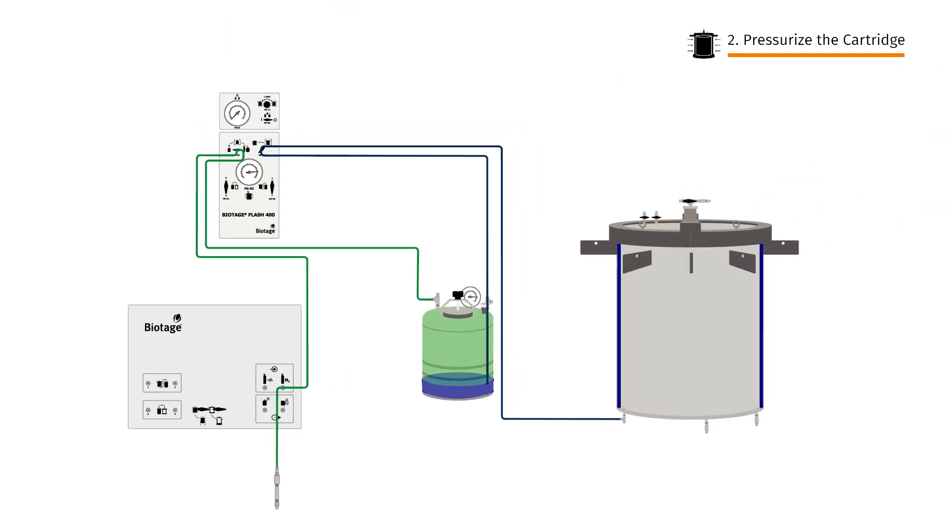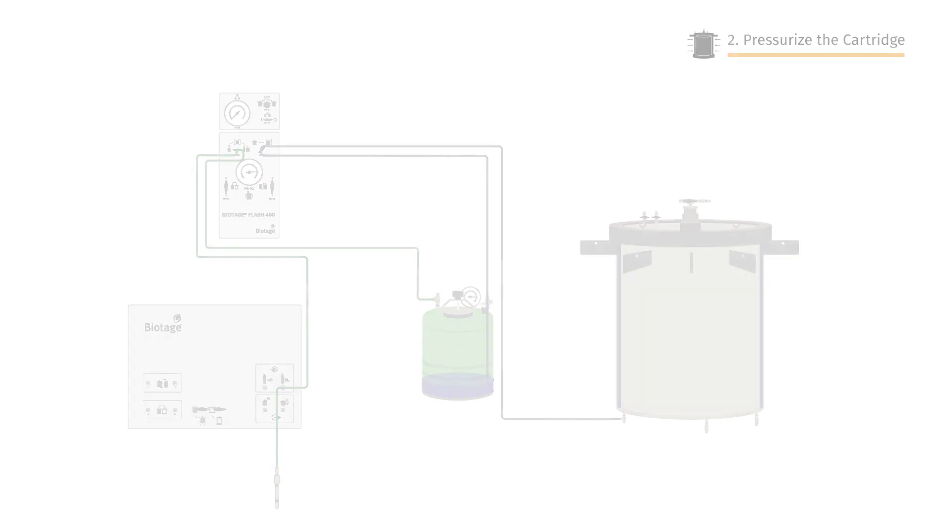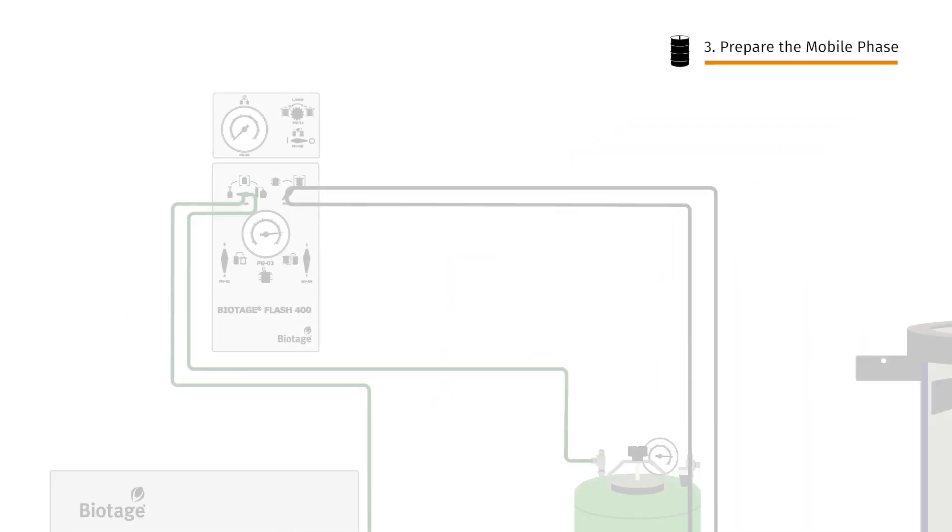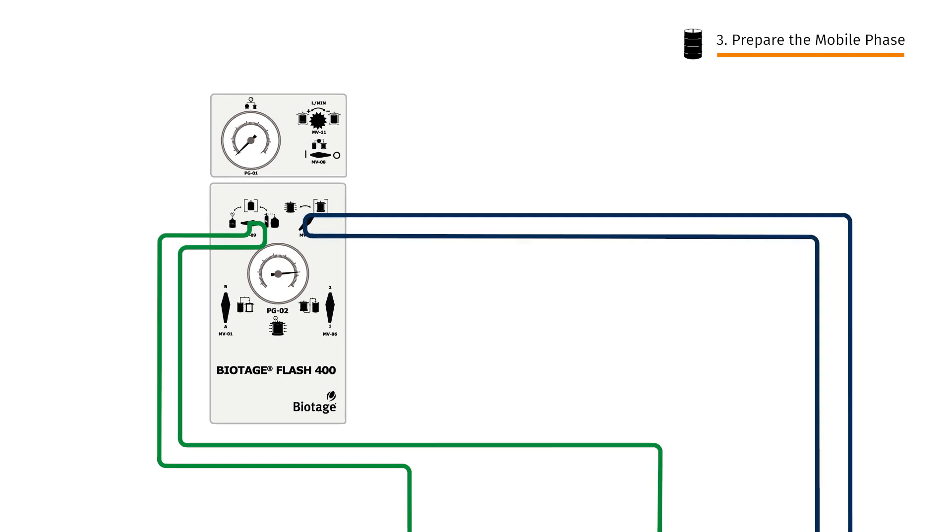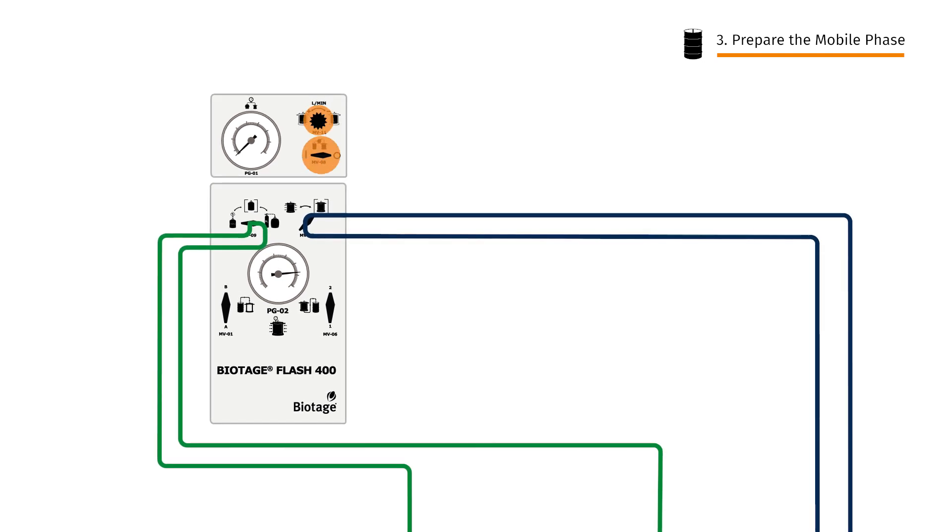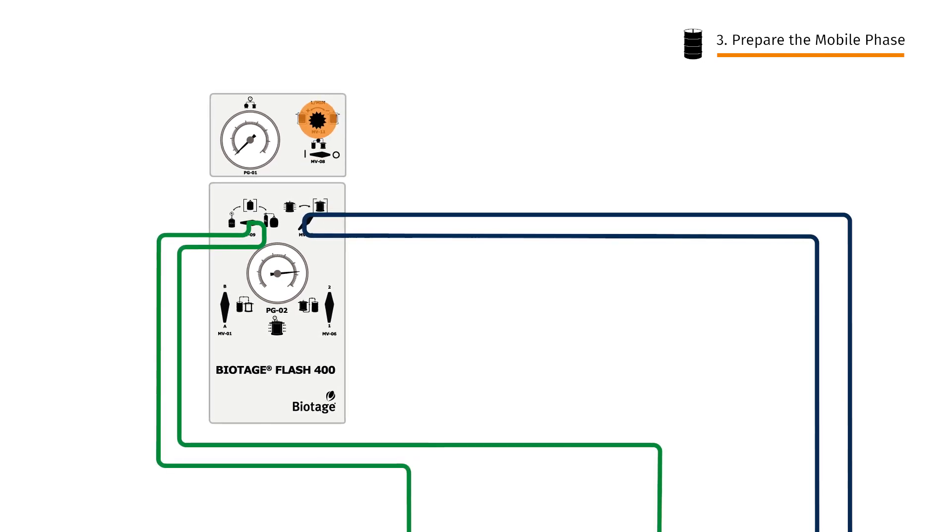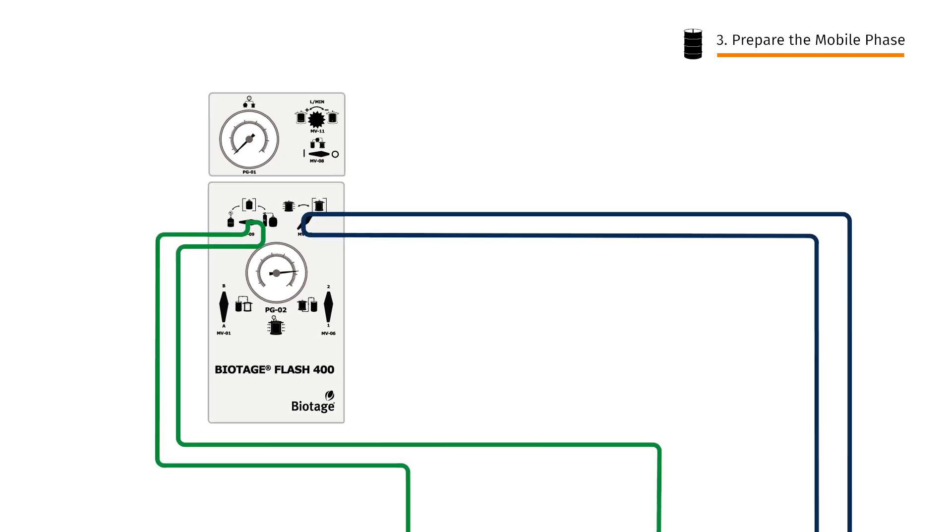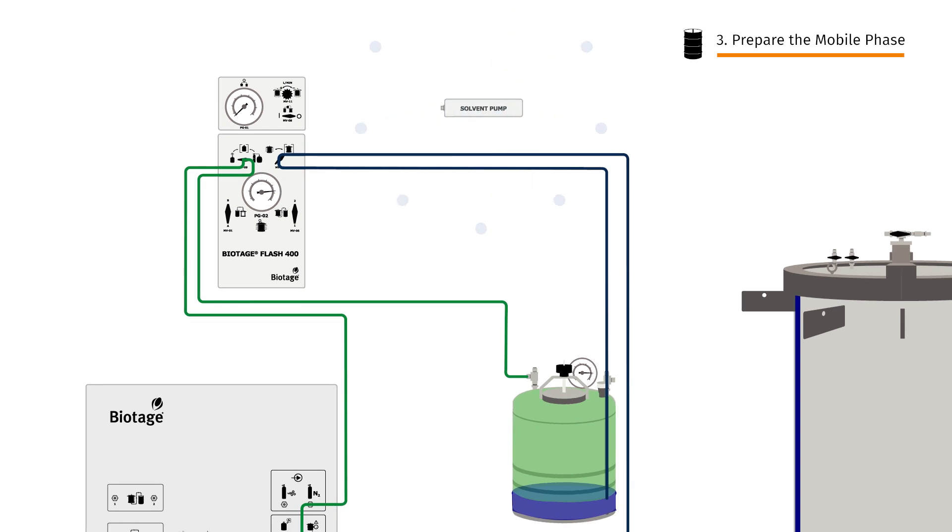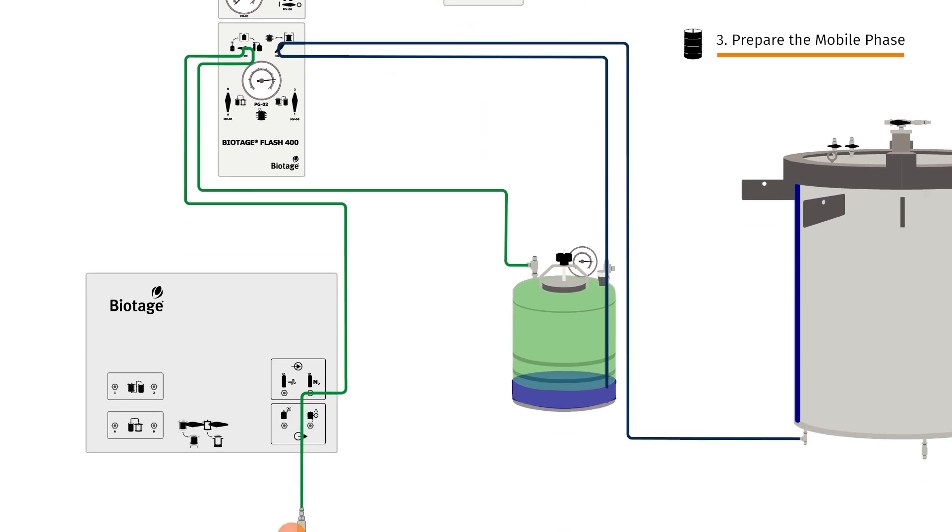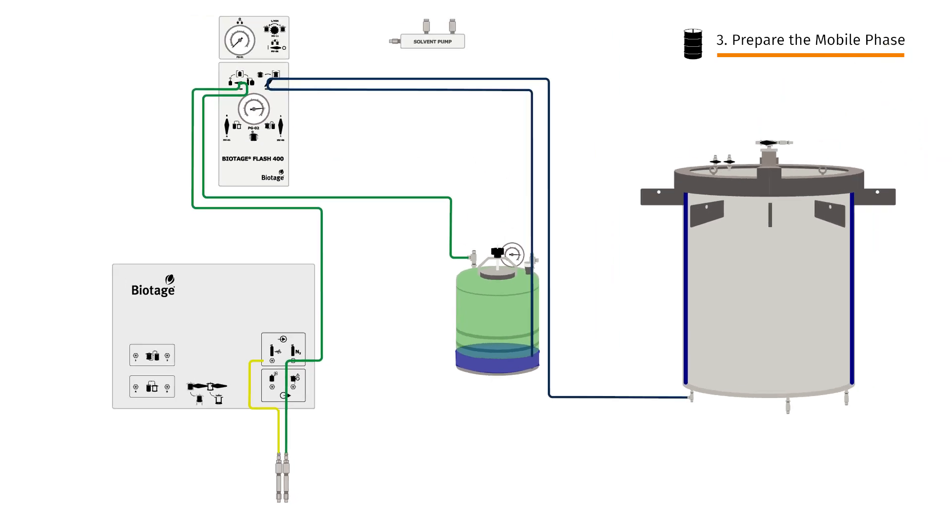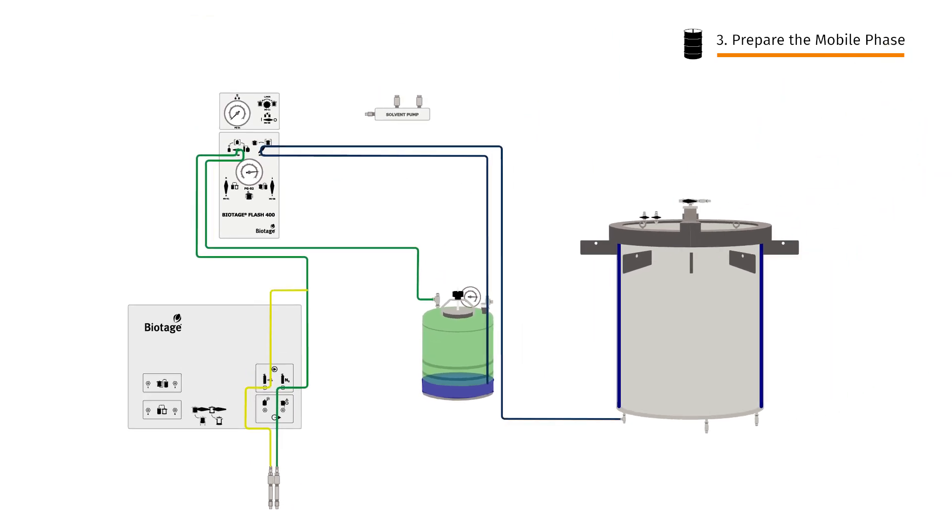With the cartridge pressurised, it's time to set up our mobile phase. First, ensure the solvent pump is off and the flow rate dial is closed. We'll drive solvent flow via a solvent pump powered by compressed air, which connects to the air inlet port down on the side panel.